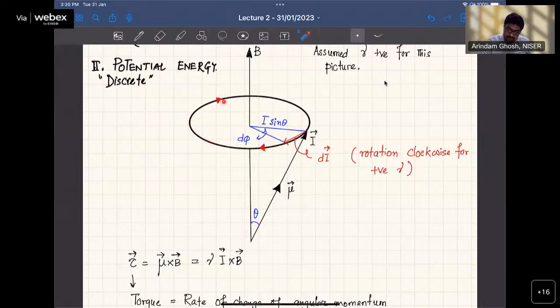That is what I have drawn by these two arrows, that this tip is going to be rotating in this direction. So that is going to give us a precession. The precession is coming. But before that, I have just drawn this way. Suppose this I has reached from here to here, so this is basically a very big one I have drawn. Otherwise, you cannot understand it.